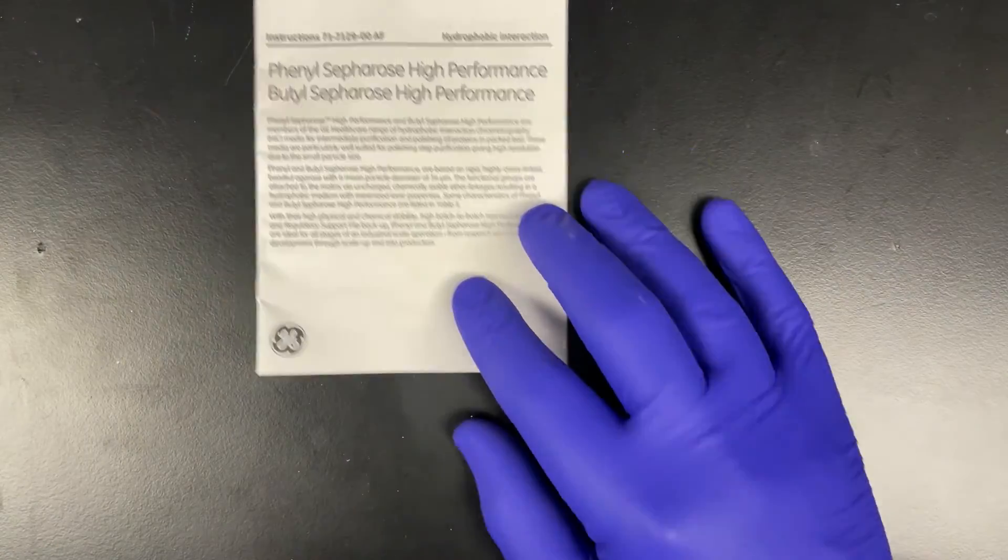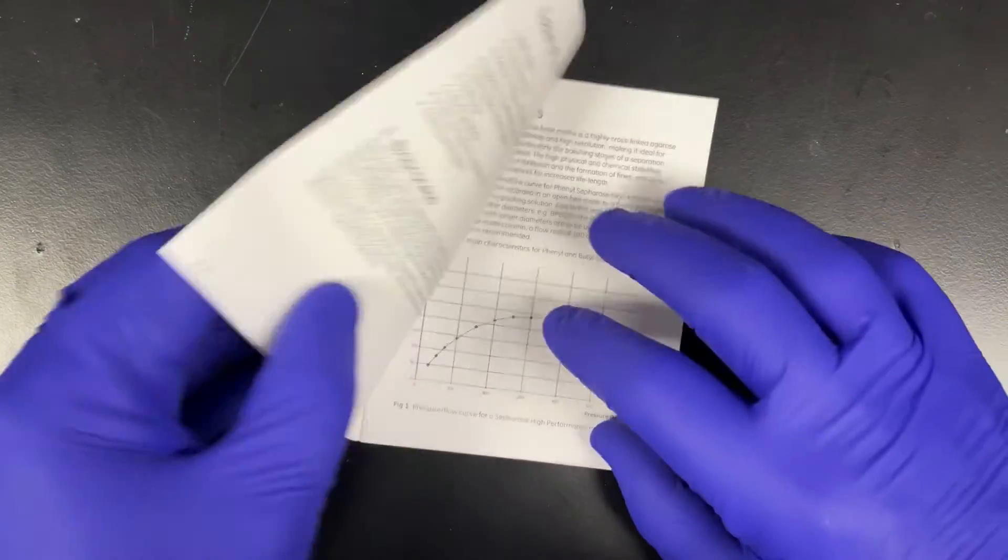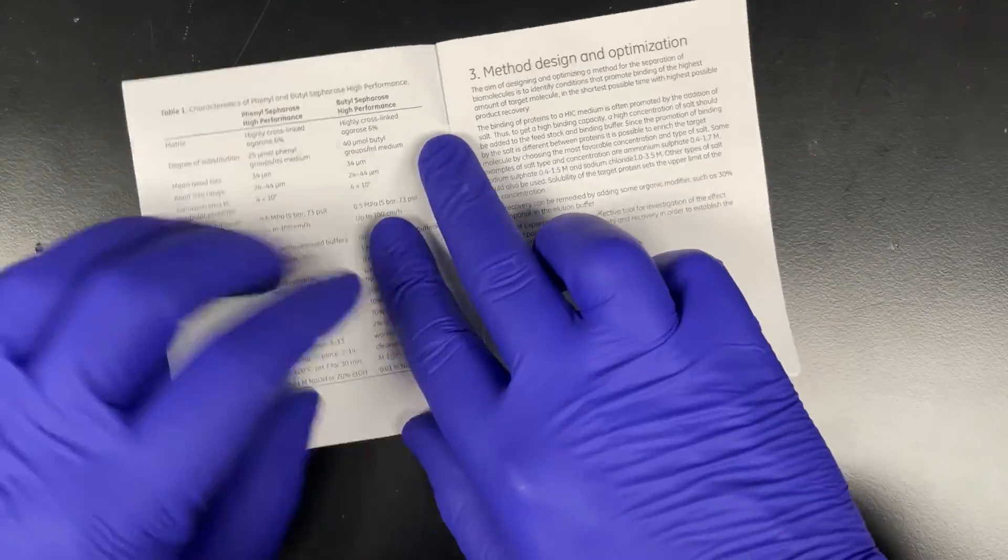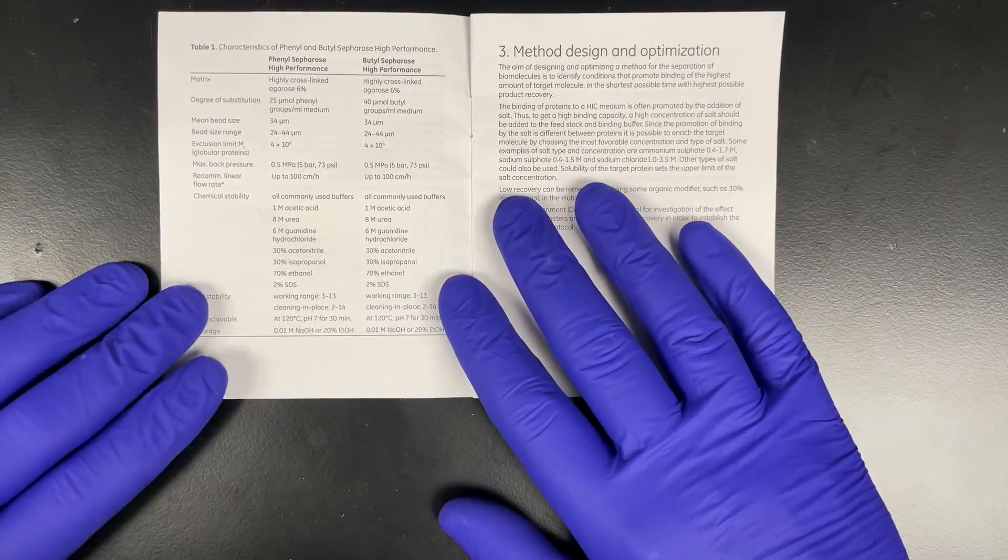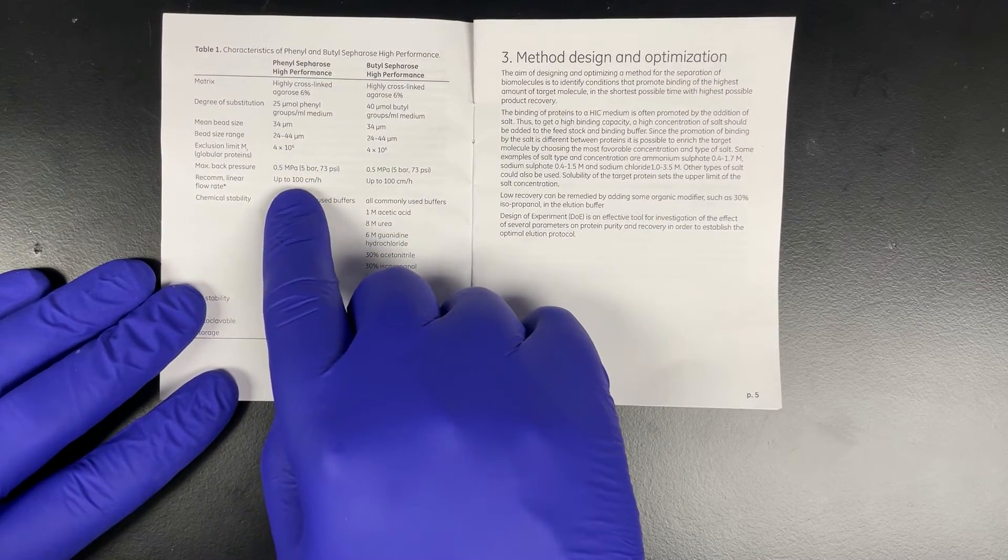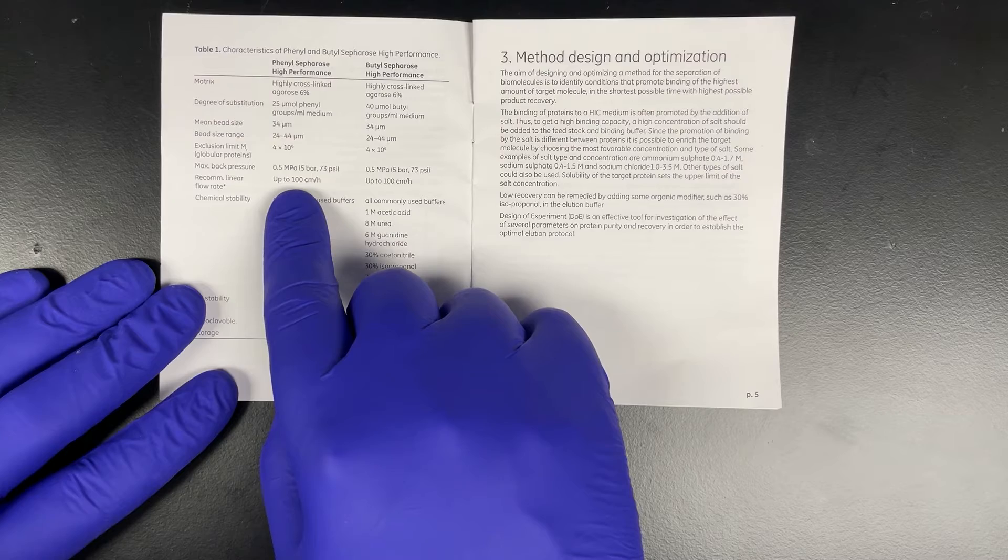One of the things we haven't done so far is to figure out what flow rate we're going to run the new column at. We'll look in the instruction booklet and we will find a recommended flow rate that's a linear flow rate, which is in centimeters per hour. For the new column, we're going to have to calculate what the flow rate is in mils per minute.